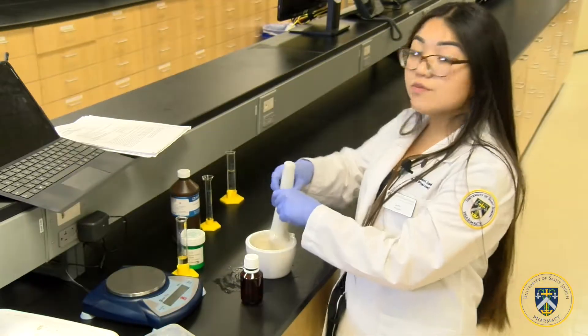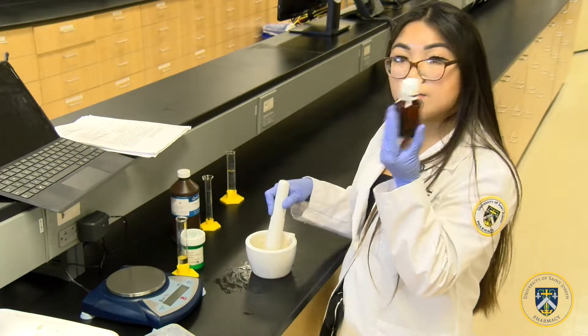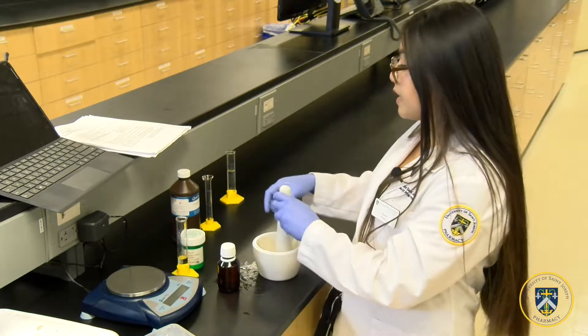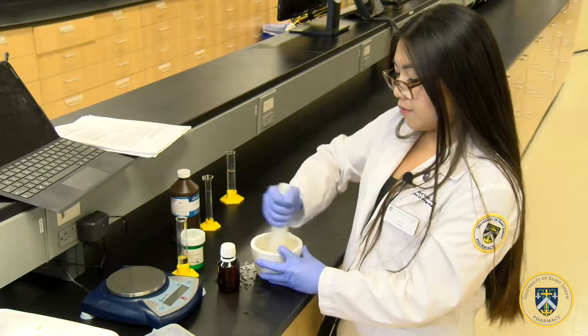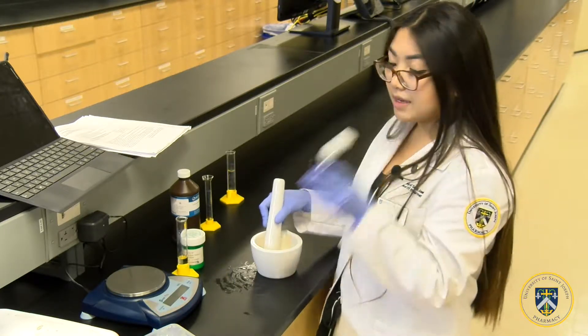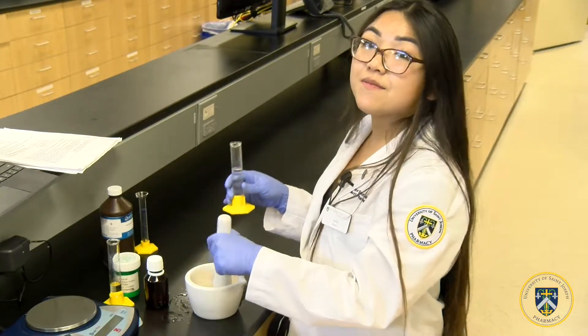You're going to make sure you have quantity sufficient up to 60 milliliters in the calibrated vial. If you do not have enough, you're going to add water a little bit at a time until you make up the full quantity to 60 milliliters.